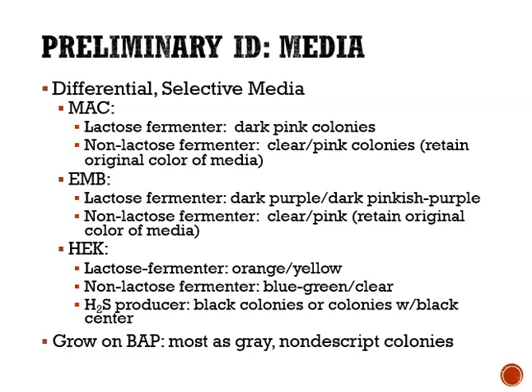Okay, MacConkey, again, and your MacConkey and your EMB are kind of interchangeable, so your lab would only use one of those. Both of those are selective for gram-negative rods, which means they've got stuff in the media that suppresses the growth of your gram-positive organisms. So we know that if an organism is growing on the MacConkey or the EMB, it has to be a gram-negative rod. But then these media are also differential based on lactose fermentation.